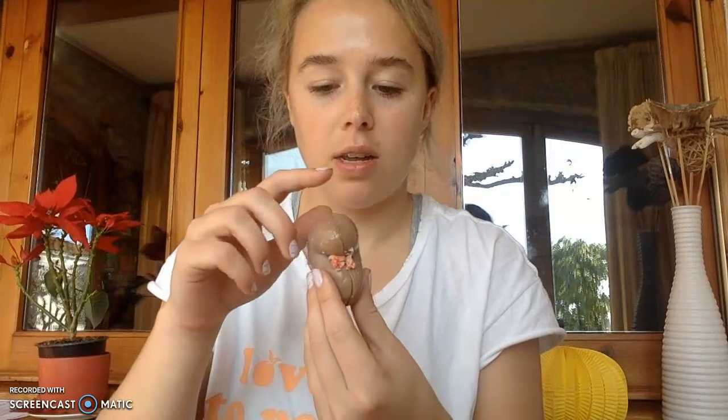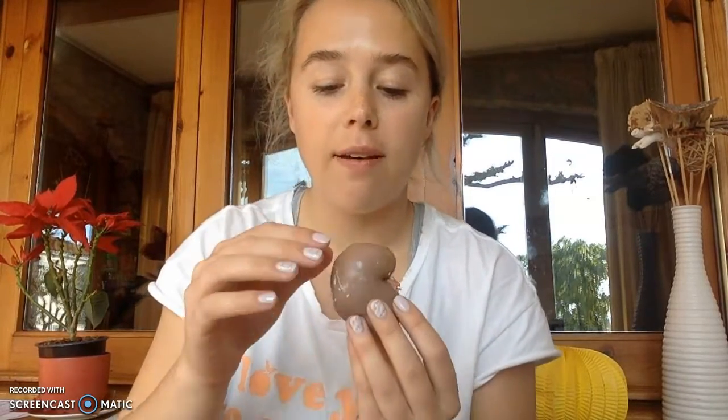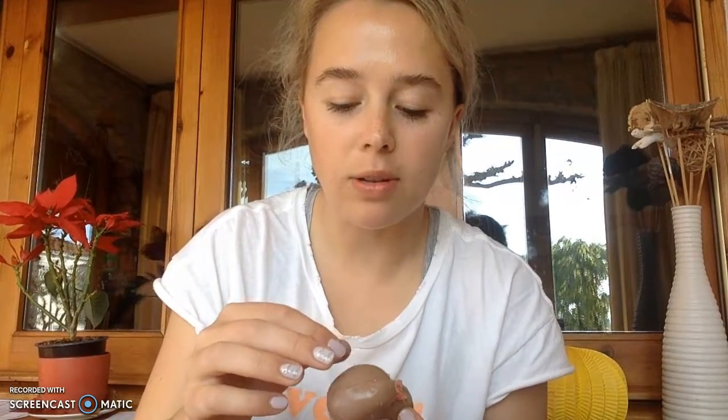So put it back together for a second. Here's the kidney, okay? This is the superior portion of the kidney, inferior portion of the kidney. And you can almost see this white outer layer around it. This is the fibrous capsule that was surrounding it. But we're going to open it, like I dissected it.